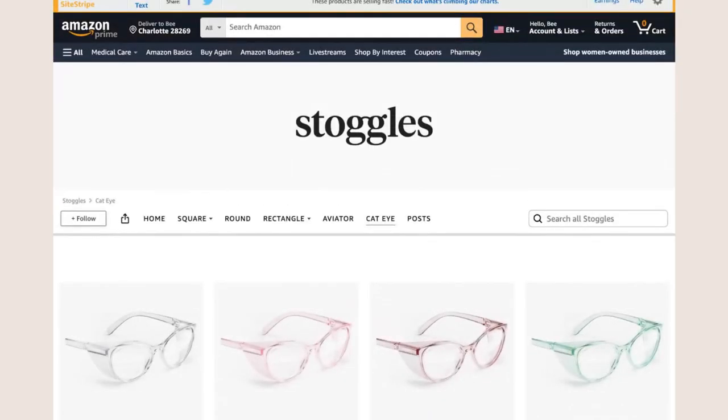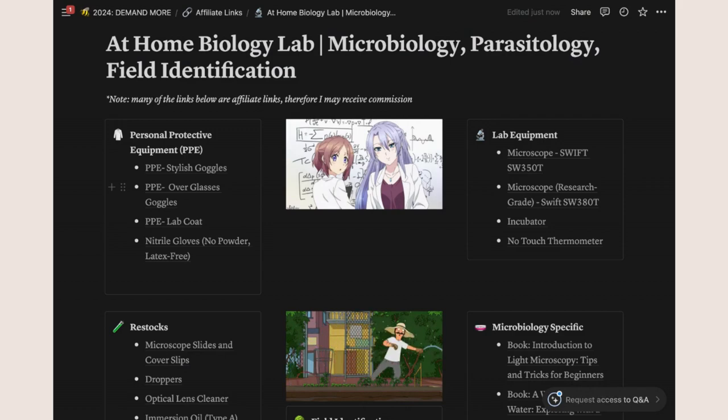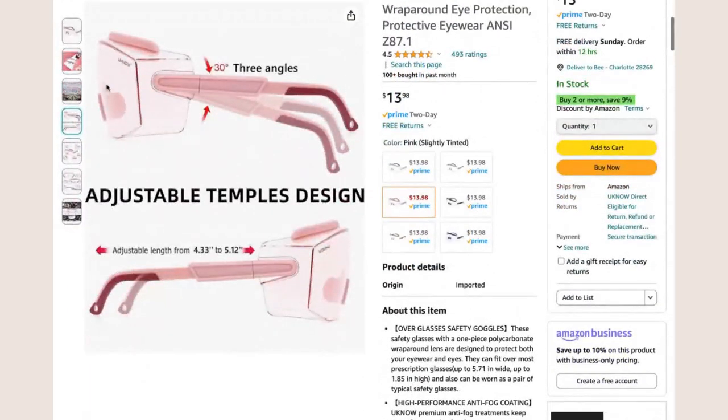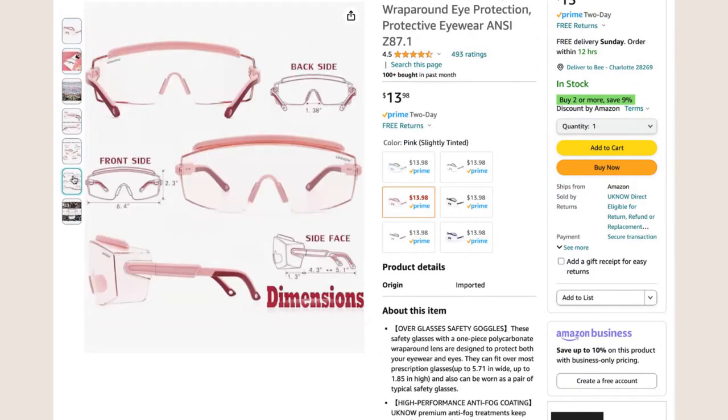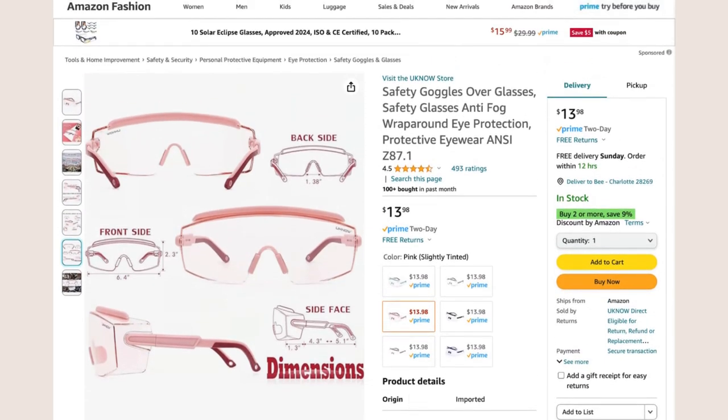I'll also show you the over-glasses goggles — these are more like what you're probably used to, just industrial-looking glasses. They had really good reviews, which is why I linked them, and they were also anti-fog, which was important to me. A lot of people complain about goggles fogging up, especially the over-glasses style, so I just want to be prepared.